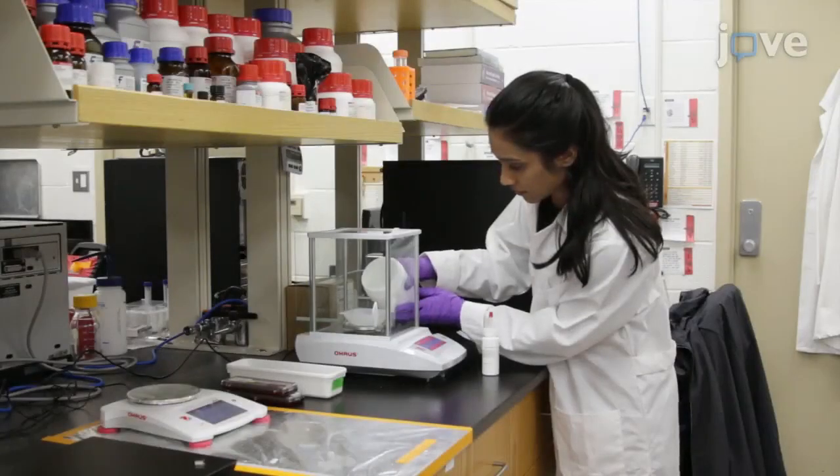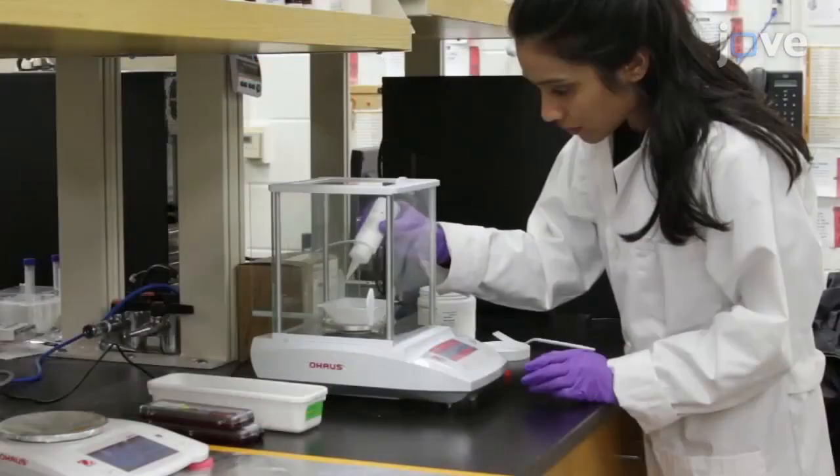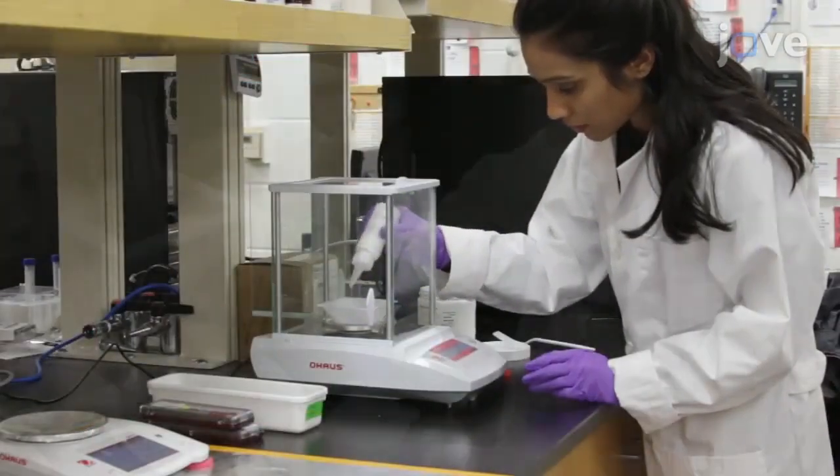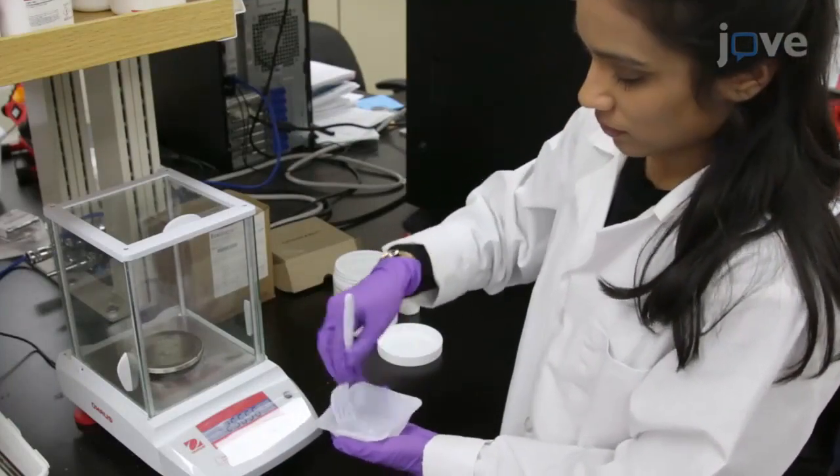To prepare the microfluidic device, add five parts of silicone elastomer base to one part curing agent in a weighboat and stir the contents thoroughly for one minute to create a pre-cured PDMS solution.